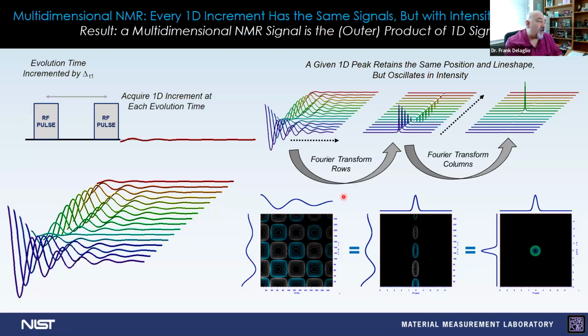And we go through this whole procedure just because a human can identify peaks in a fully transformed spectrum, but not so well in time domain data. So in a sense, this whole procedure of spectral reconstruction is a convenience to allow spectral data to be analyzed visually.